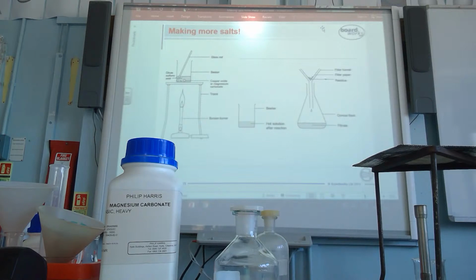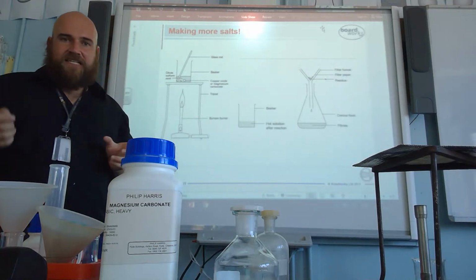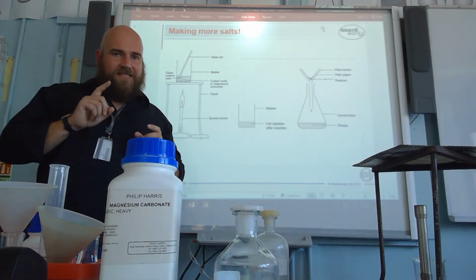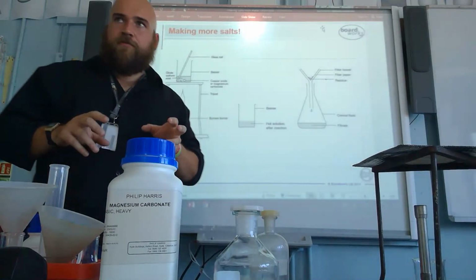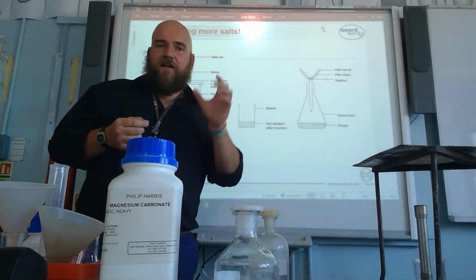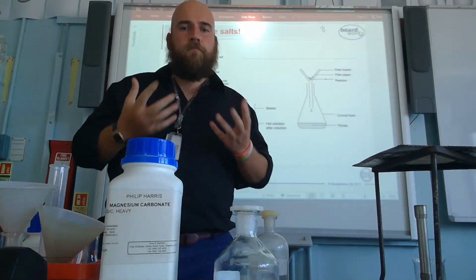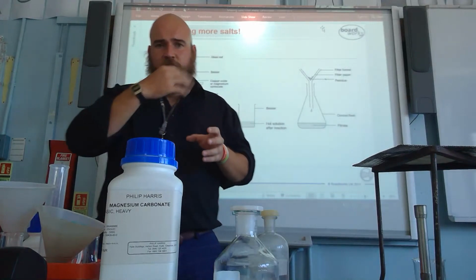First things first, you can see, similar method to last week, heat the acid and then keep adding the solid, so in this case the magnesium carbonate, until it's in excess. I'm going to do it slightly differently because I've just seen that this reaction produces quite a lot of effervescence. And I imagine if I was to heat the acid first and then put the carbonate in, it would effervesce even more, which could be quite dangerous. You don't want to have hot, nearly boiling acid spraying everywhere.